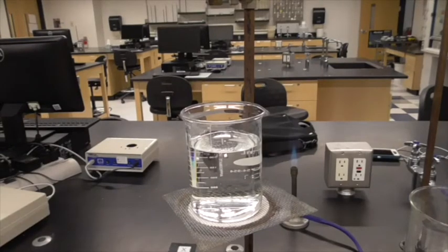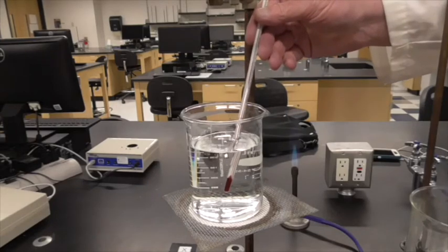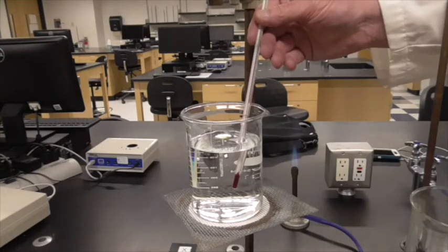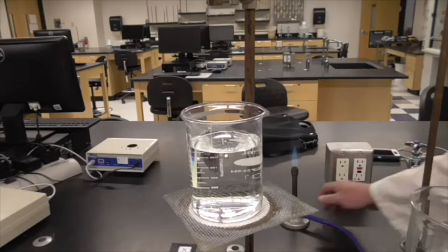All right. So while that's melting over there, I want to make sure my water's at 40 degrees, right? Because that's what we need to start it at. And it looks like a little bit low, so we're going to put our Bunsen burner over here and let it heat up a little bit.